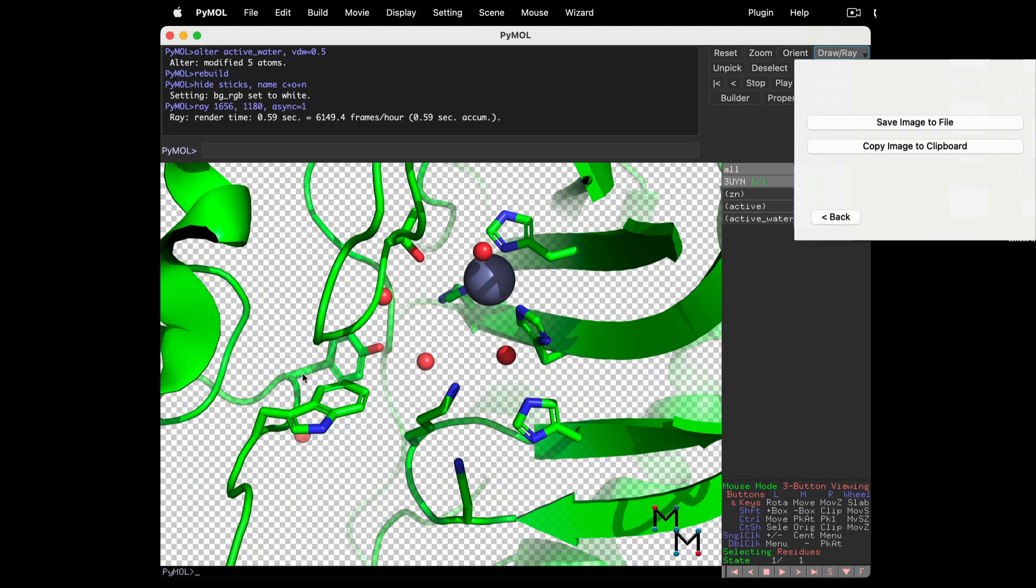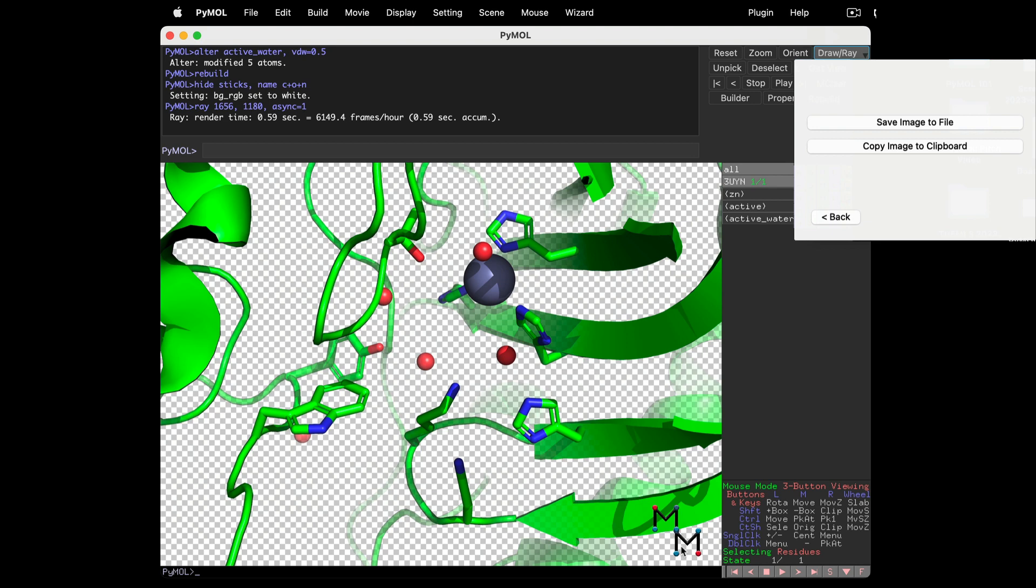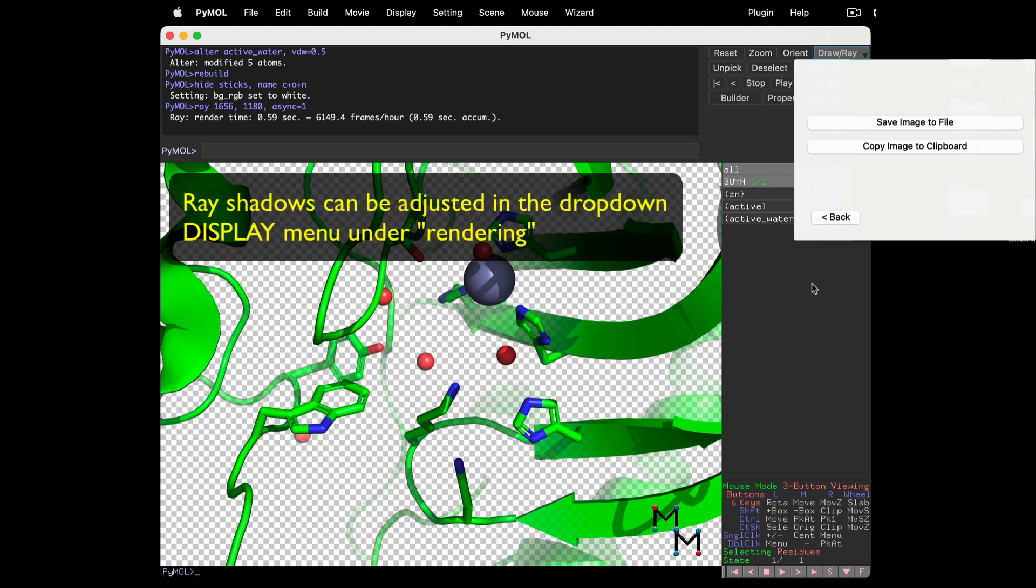If you have the option to ray, this will add a transparent background and make a very sharp image. It gives some additional depth, and makes it look like there's a light shining on the structure. This creates shadows, like we see right here, which may not be preferred since there's actually no spotlight within a cell.